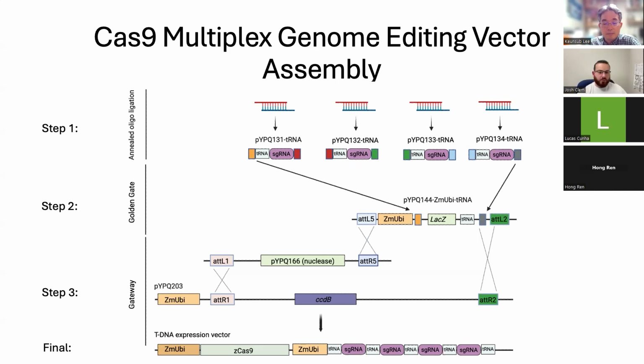And that's one way in which you could likely improve CRISPR-based genome editing, just by optimizing the expression and preventing transcript read-through, which would be one goal with that. Also reducing silencing, since the Arabidopsis heat shock 18.2 terminator is derived from a plant, could reduce silencing. So I will say we just use NOS-T most of the time, but it's something that could be improved on.